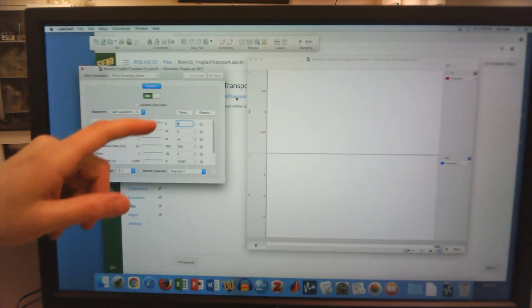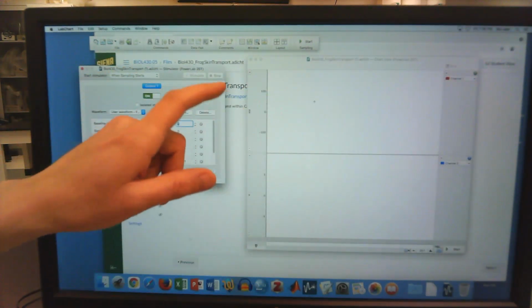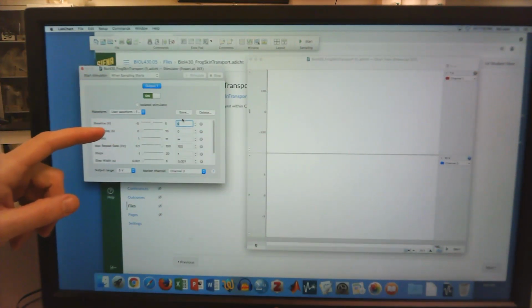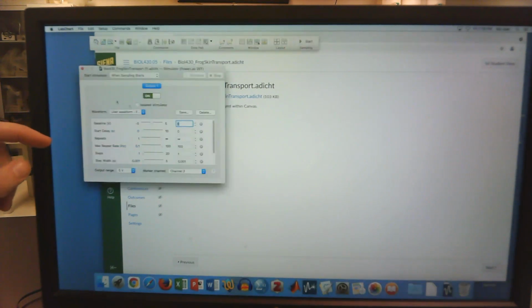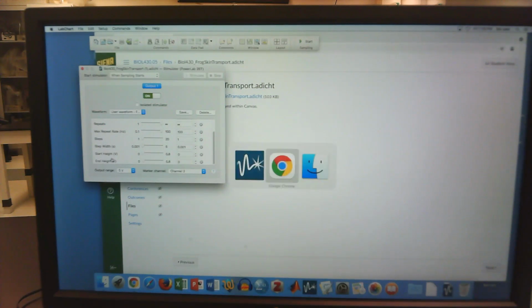Okay, so here in Chart, we've got two different windows going now. The window right here that you see is the stimulator window, and the other window is our usual kind of recording Chart window. In this stimulator window, most things are set up for you. What we're going to work with is an option if you scroll down here, or if you enlarge this window. So if you scroll down, you're going to see an option for adjusting the start height and the end height of your stimulus.